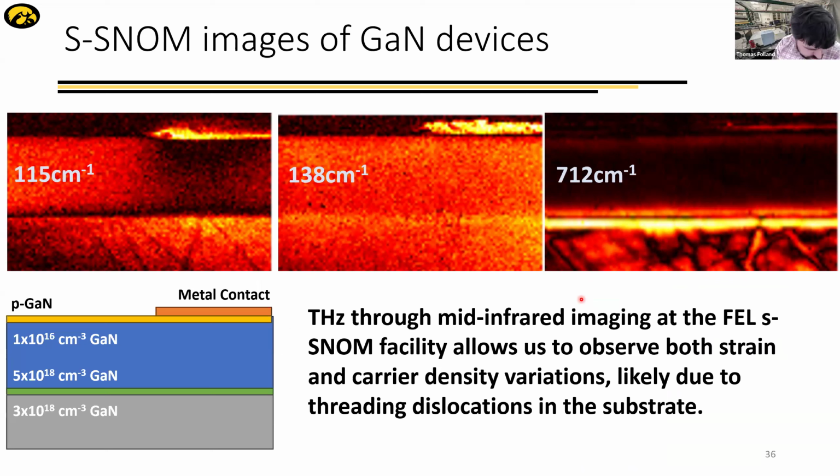When we do fitting to the optical parameters, people do it differently, but one of the common approaches is to use the thin slab approximation. We have a certain material with a small thickness, and we have the 3D dielectric function of that material. And people are normally not really bothered by the fact that if you put the thickness of this layer to 0, the limiting case is no reflection at all.